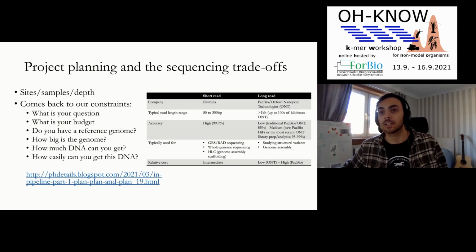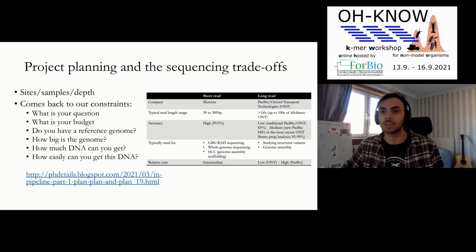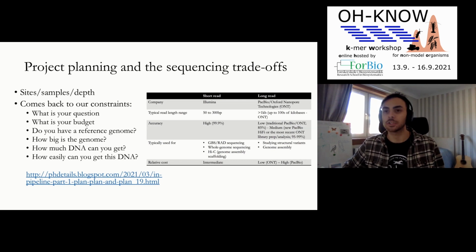The amount of DNA that you can extract is actually, I think, a very real consideration for people that work on small things. So, what's the realistic depth that you're going to get from a single individual if you have limited DNA to start with? And how easily can you get that DNA? Are you going to end up with months in the lab trying to produce a new extraction protocol? Or are you better off just doing some kind of different sequencing approach?